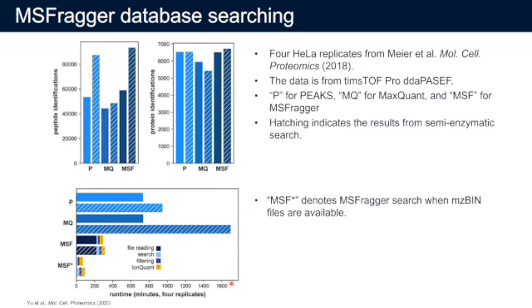We also performed runtime comparisons, and it also shows that MSFragger is much faster than PEAKS and MaxQuant. Since the DDA PASEF data is much bigger than the Orbitrap data, the loading time actually takes a big percentage compared to the total run times.